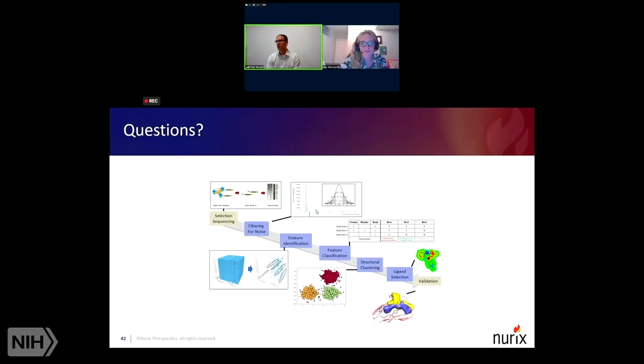Sure. So there are a couple of different factors here. One is going to be the visualization that you want to use. You're going to need a computer and a visualization package that can really handle the volume of data you're going to get out of this sort of technique. So we use Spotfire. I've heard of DataWarrior. I believe there's a program from Informatics as well. But that's going to be one component. And trying to analyze the data and having your cube continually freeze up on you every time you try to rotate it is going to be maddening. So definitely make sure your IT group is giving you a pretty decent laptop.